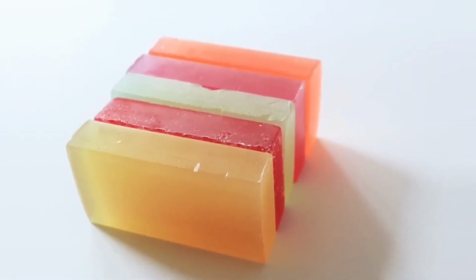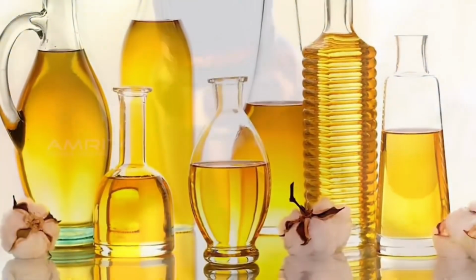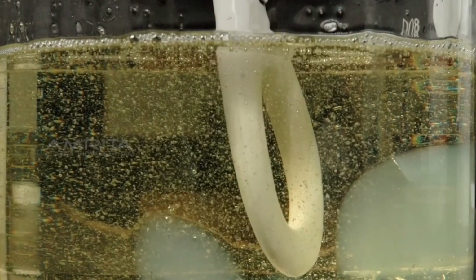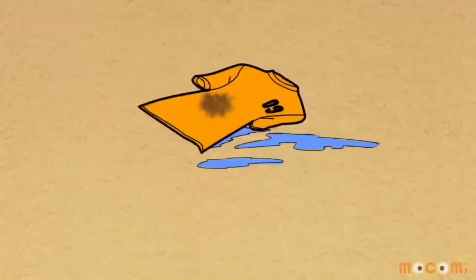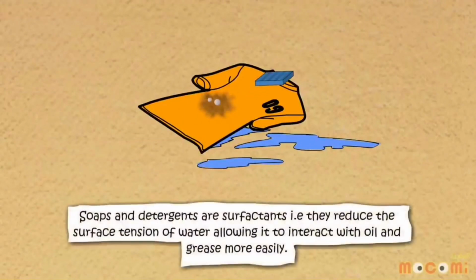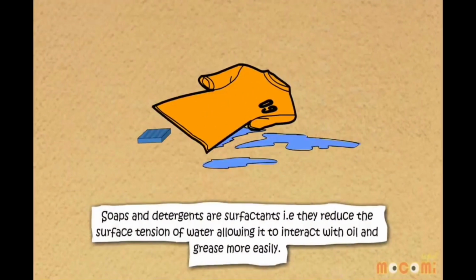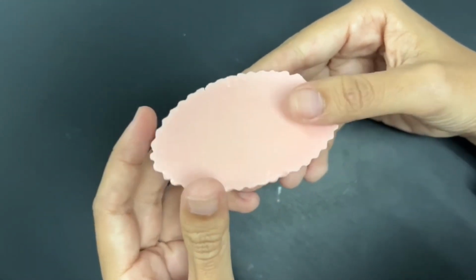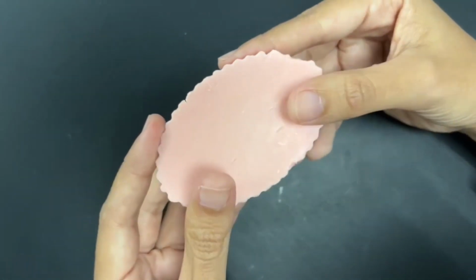This process obtains useful, cheap and good quality soap by using waste products like used cooking oil as a major raw material. It is an innovative and eco-friendly approach that not only recycles waste material but also contributes to sustainable living, and it is used as a biodegradable cleaning product.